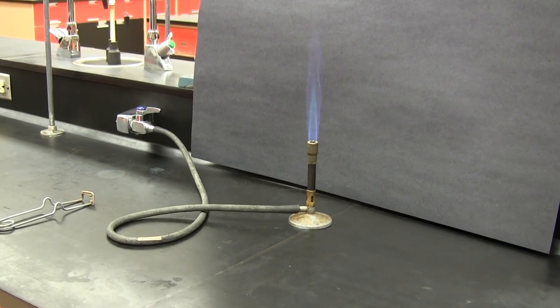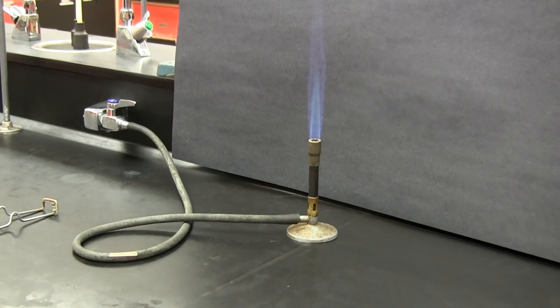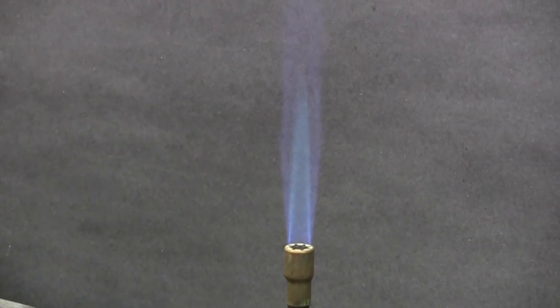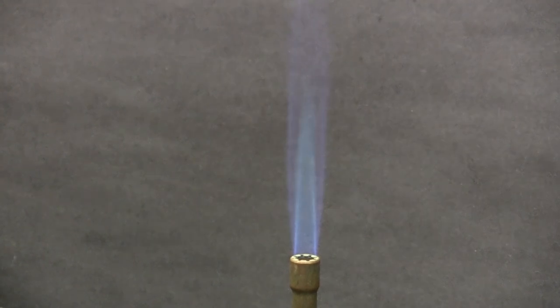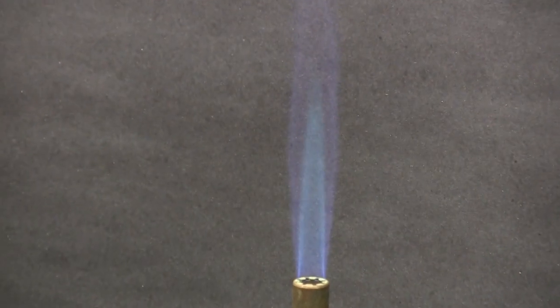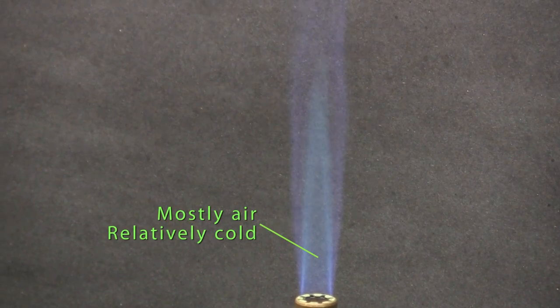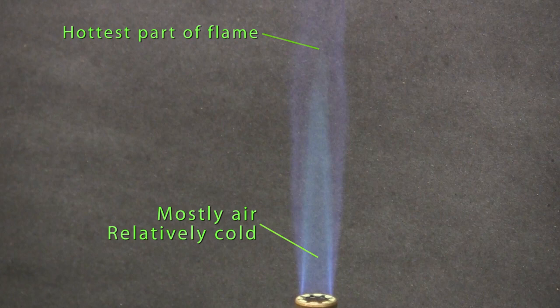Now looking more closely at the flame, we can see an inner cone shaped flame which has a different blue color to the rest of the flame. The inside of this blue cone is actually composed of air and therefore it's relatively cold. The hottest part of the flame is just at the very tip of the cone where the air is now fully mixed with the surrounding gas.